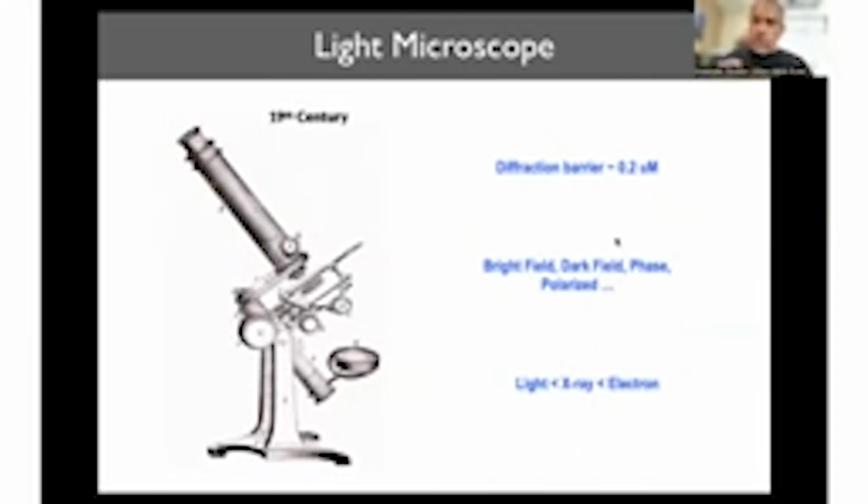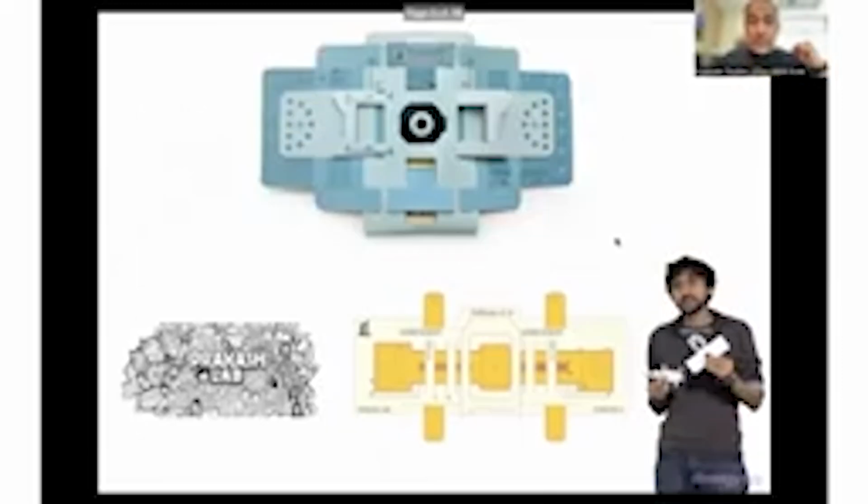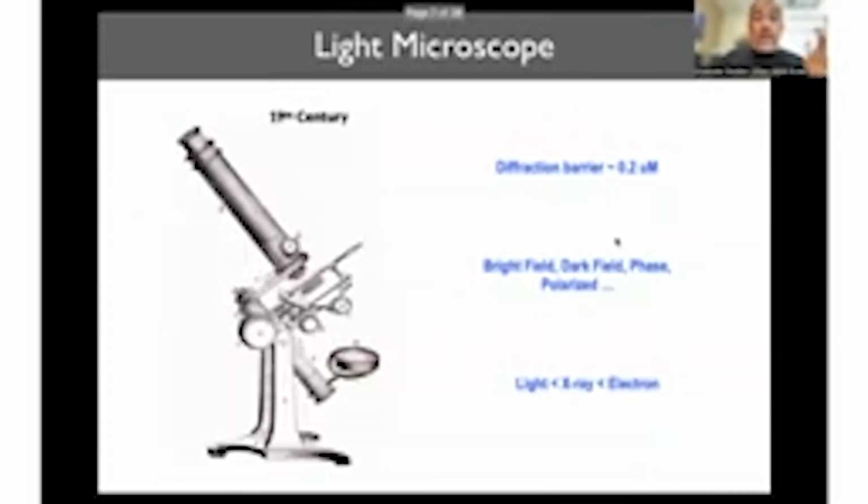Now the thing to remember here is that a lot of the visualization that happens through microscopes, particularly the light microscopes, right? So everything, including this particular microscope, or Manu's Foldscope, are all light microscopes. So essentially, the source of light that is being used to look at stuff has a significant impact on how you can resolve things. Okay. And this is something to go think a bit about, right? That what exactly is this diffraction barrier, right?